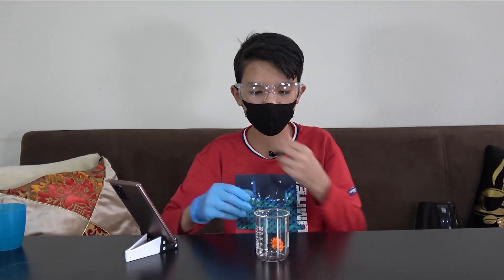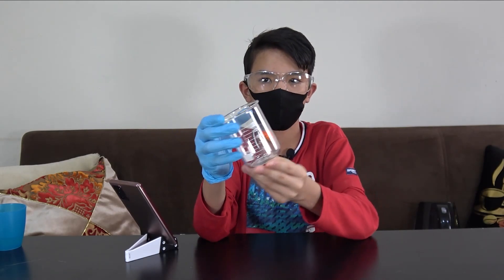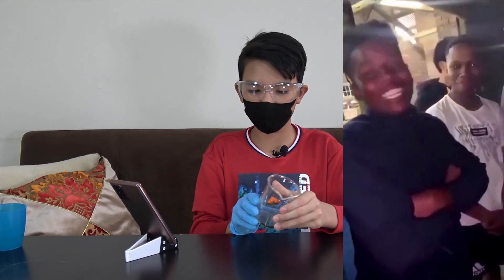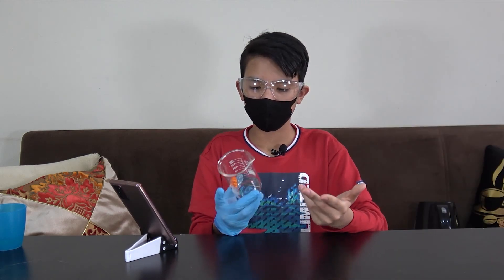Now we wait until the flower changes color again. It looks like that's it for this experiment — our flower turned into a nice orange color, mashallah! I don't know how I ended up wearing this mask, but it is what it is. That's it for this video — I'll catch you guys in the next one.